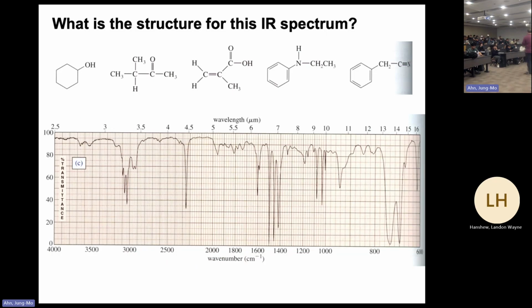All right, moving on. This one, which is the most characteristic signal in this spectrum, which I want you to recognize right away, is this one. There is a normally flat line here between 2000 and 2500, nothing really showing up unless you have triple bonds. So having a signal there, that is definitely the most important signal. You should pick it up. And then there's a 2200, and it's pretty strong, right? So I would consider this kind of nitrile.